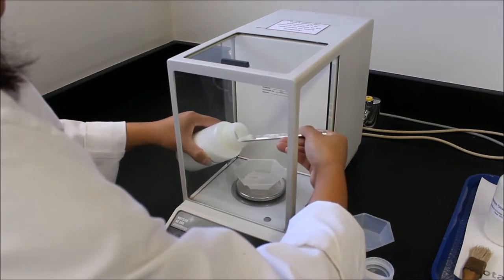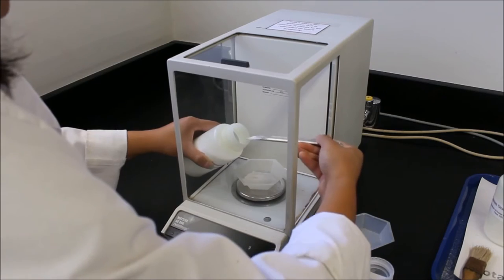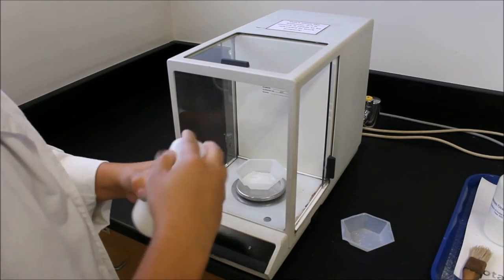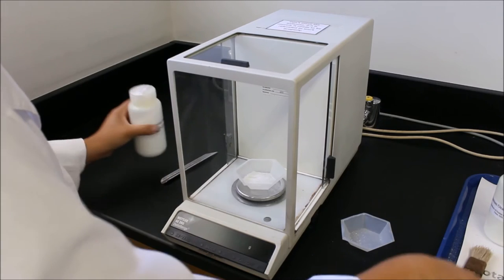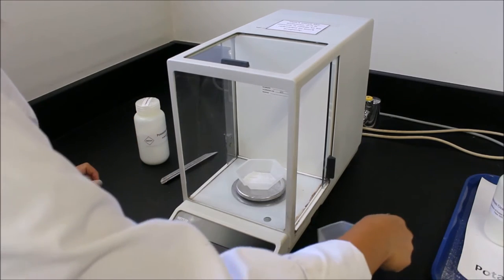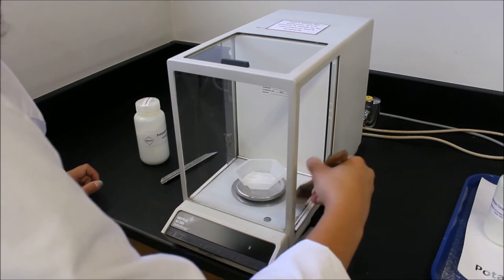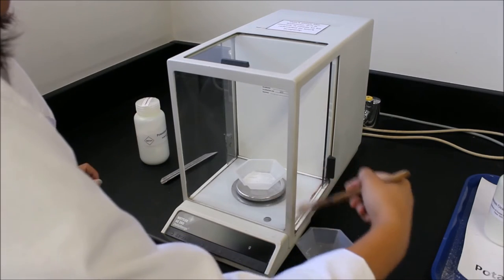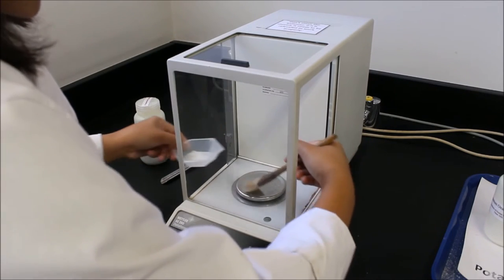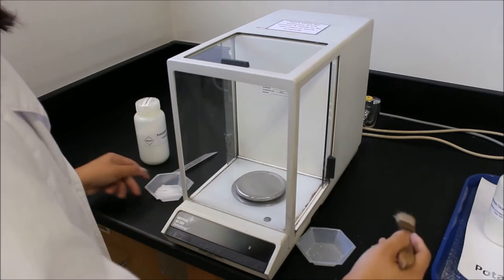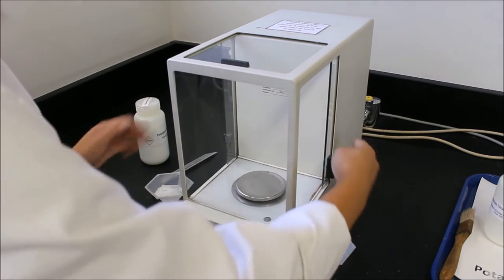And if by accident you end up spilling some of your compound, you're going to want to clean that up with a brush that is usually found next to the analytical balances. You'll just sweep it into this little waste container and you'll be all ready to go. Make sure that you clean these after you're done using them so that we can keep this lab nice and tidy.